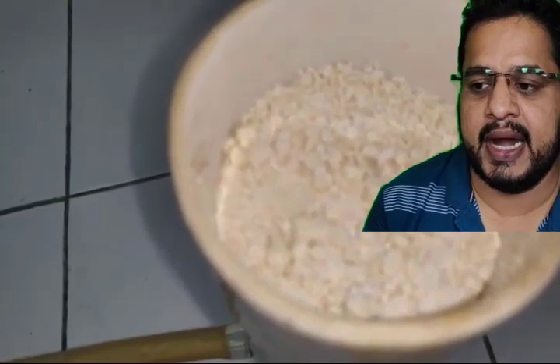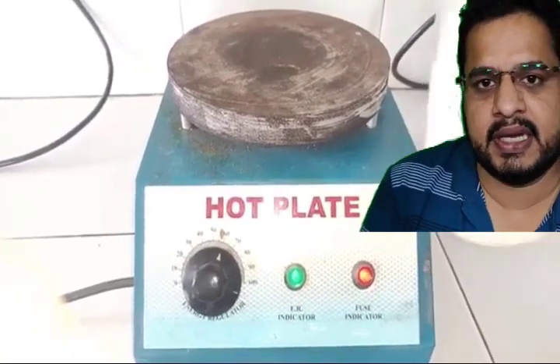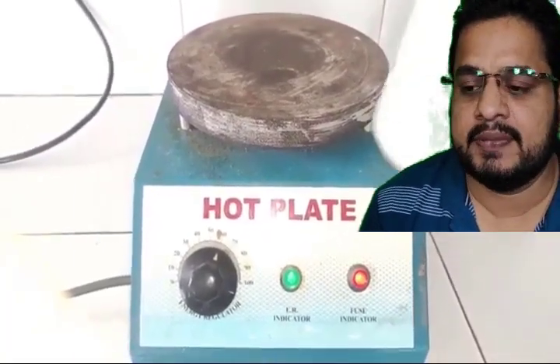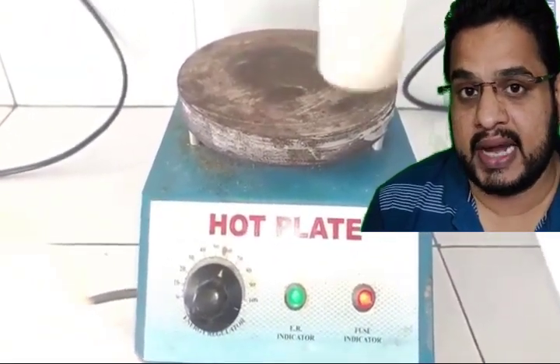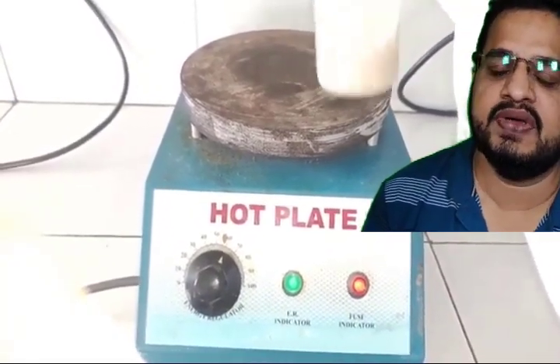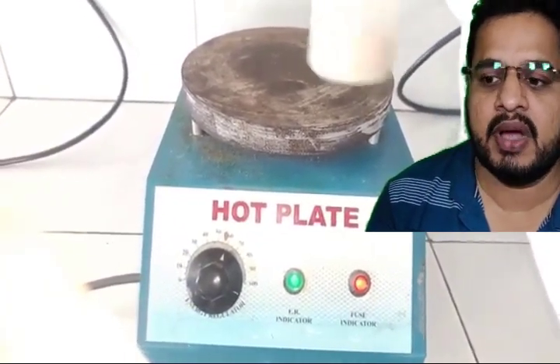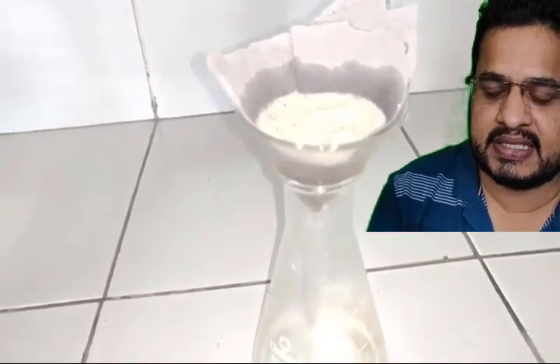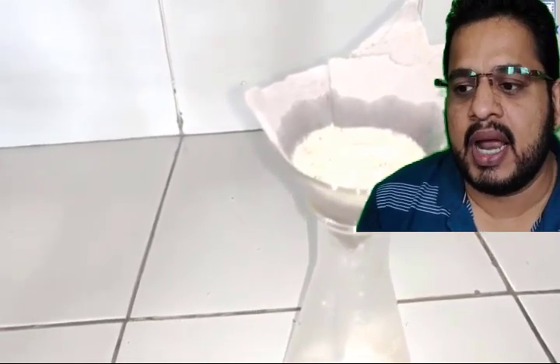Again we are going to add alcohol to it, and after alcohol we will shake it, and on a hot plate we will just make it warm, so that your compound will get solubilized in the alcohol at higher temperature, and we will shake it well, and then we will cool it. Once we cool it, all the soluble impurities will remain in the alcohol in solubilized form, but this benzanilide will be crystallized out. This crystallized benzanilide we are again filtering out, and on the filter paper what you are finding is the recrystallized benzanilide powder.